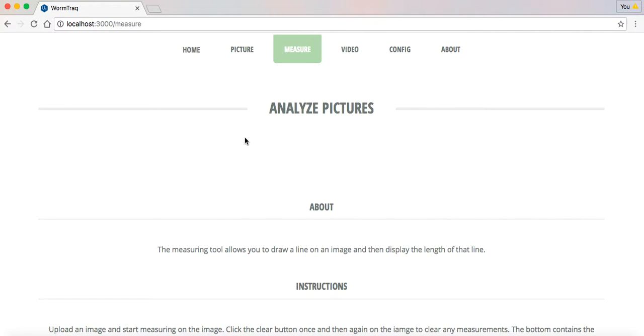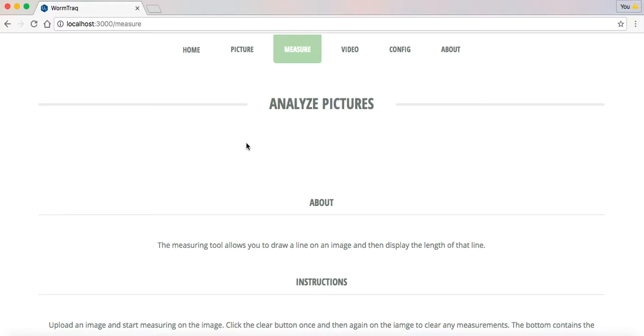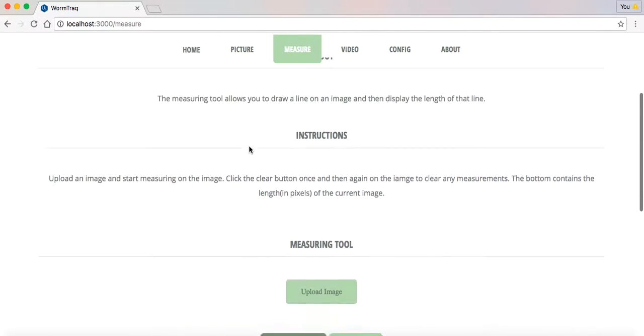And again, noise removal removes noise. Hue, contrast, vibrance is able to do some pre-processing of the image. And we have a detection threshold, which is detecting the minimum criteria.